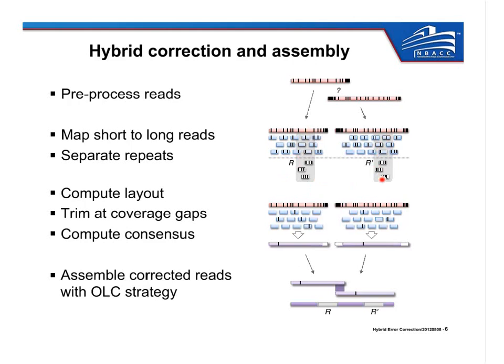So we sort these alignments based on identity. We look for the short reads that best map to the long read, and then we determine a cutoff based on the coverage, and throw away all of the low identity, high coverage reads that are likely coming from repetitive copies. This is in an attempt to get a correct reconstruction of not just the unique sequence in the genome, but a correct representation of each of the individual repeat copies. There might be subtle polymorphisms within the repeats that we want to make sure we get. Once we have that, we compute a layout.